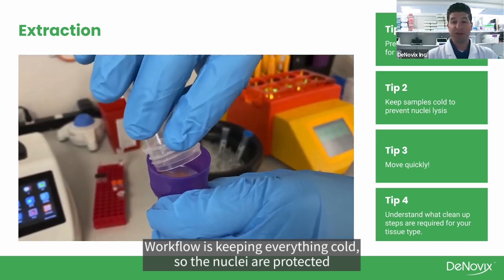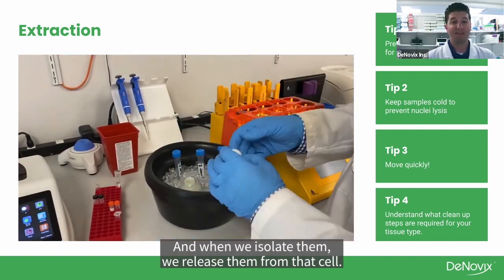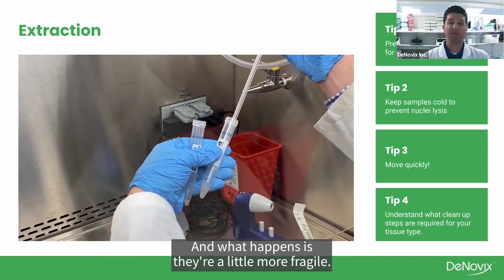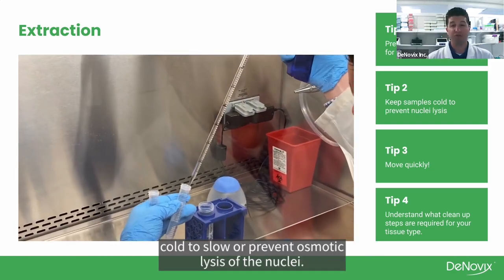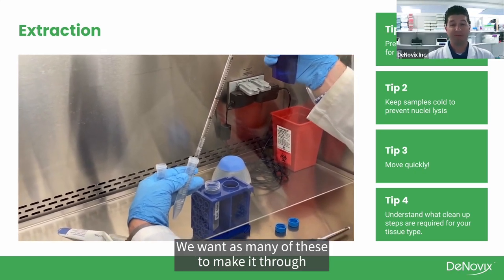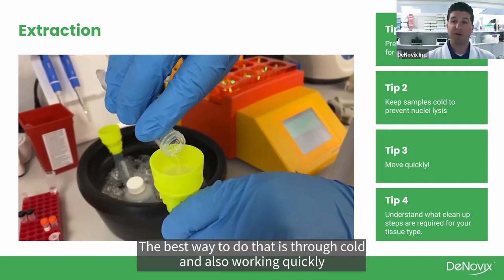The nuclei are protected generally by the cell membrane. And when we isolate them, we release them from that cell, and what happens is they're a little more fragile. So we want to move quickly in this process, and we want to keep everything cold to slow or prevent osmotic lysis of the nuclei. We want as many of these to make it through to the sequencing step as possible. The best way to do that is through cold and also working quickly.